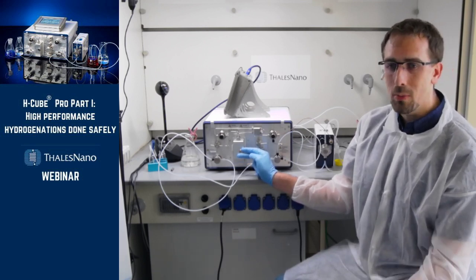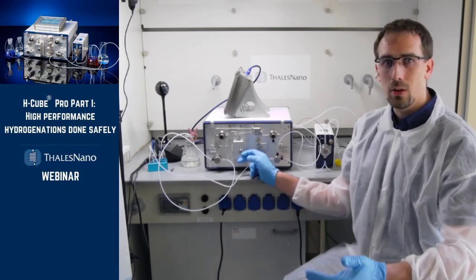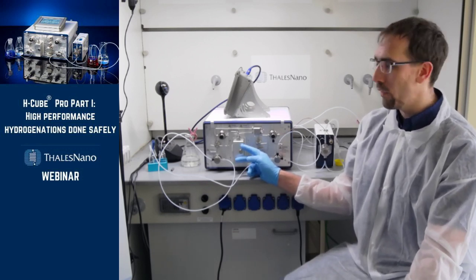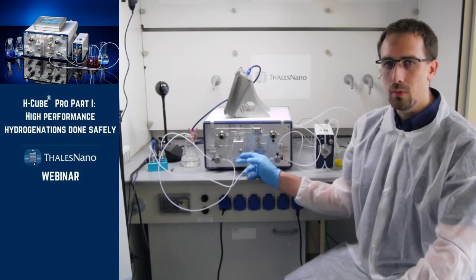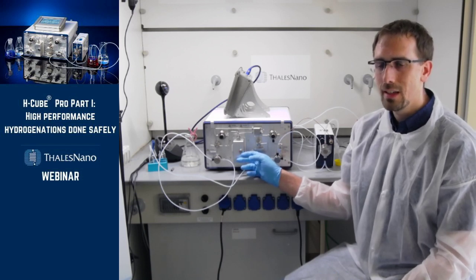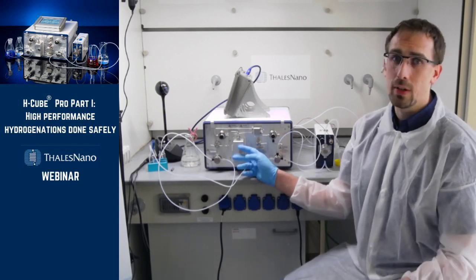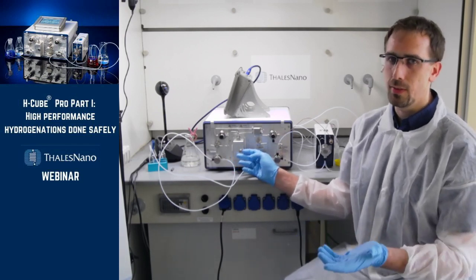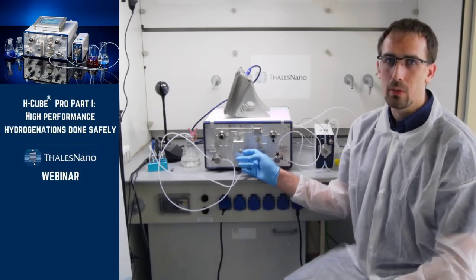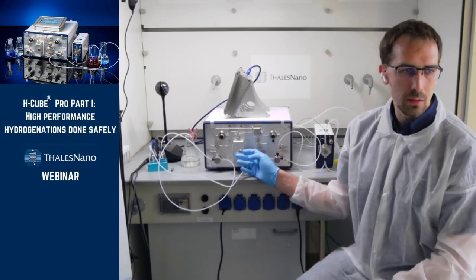If you have a homogeneous reaction which requires 16 or 30 minute residence time, let's say, it would be very difficult to perform on the H-Cube Pro because you would need to operate the instrument with really low flow rates, and then your throughput would be really small. So that's an example. For that, I would recommend the Phoenix flow reactor for homogeneous reactions with fairly long reaction time, like 15 to 120 minutes or so.